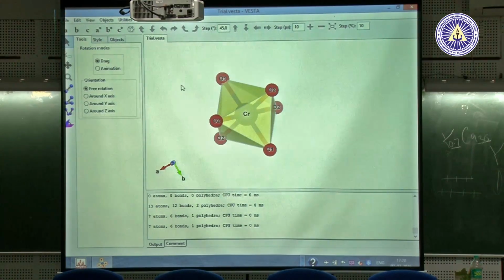Yes, reciprocals. But don't be confused, just for visualization here. Can we replace some atom by some other atom? Can we replace an oxygen atom with a nitrogen atom? Whatever you give the software, with respect to your lattice parameter and atomic position, it will just give the bond length and bond angles, and nothing more can be done in VESTA software. In other software we can do that. I don't have an idea; whatever I know, I would like to share here.